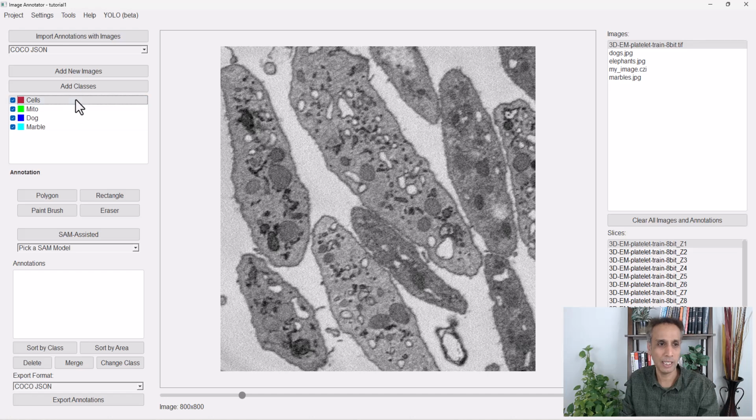And now I'm going to select cells and select one of these tools. So let me select polygon tool. All you need to do is click, click. I don't have a mouse. I'm using the laptop's touchpad, and I'm not good with that. Why do I not have a mouse? Because all my USB slots are taken with my webcam and stuff. Okay, at the last point, just double click. So it closes it and adds this. And you can see, okay, this is it, the area.